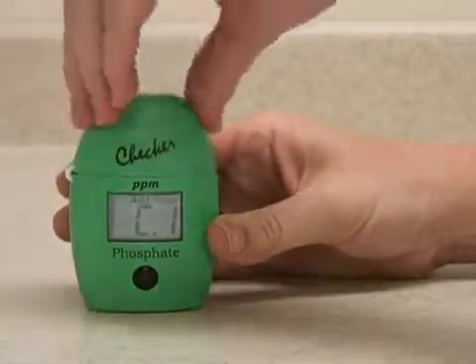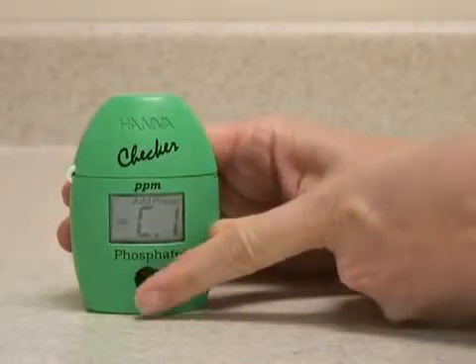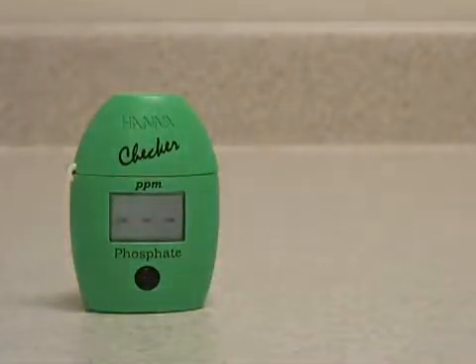Insert the vial into the meter and press the button again. It will flash bars at you to let you know it's sampling.